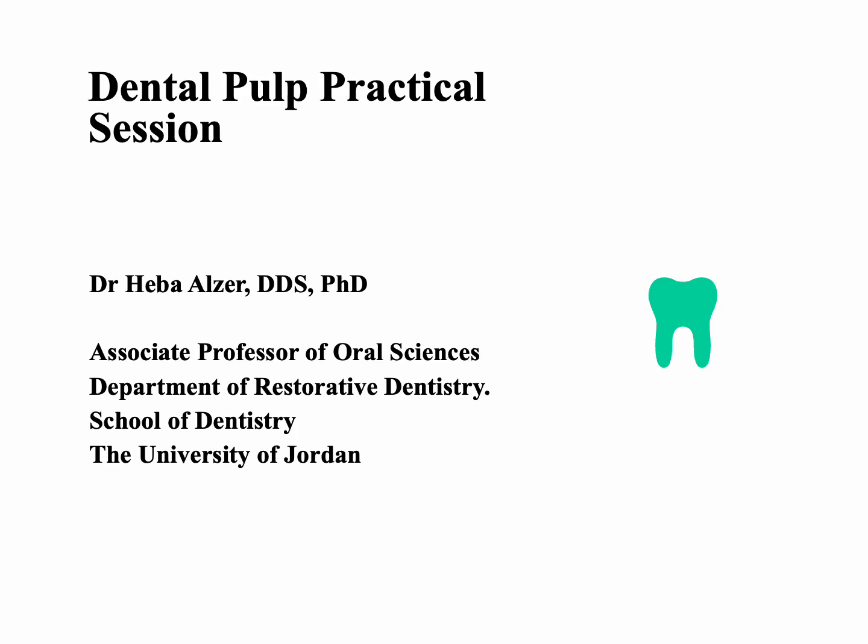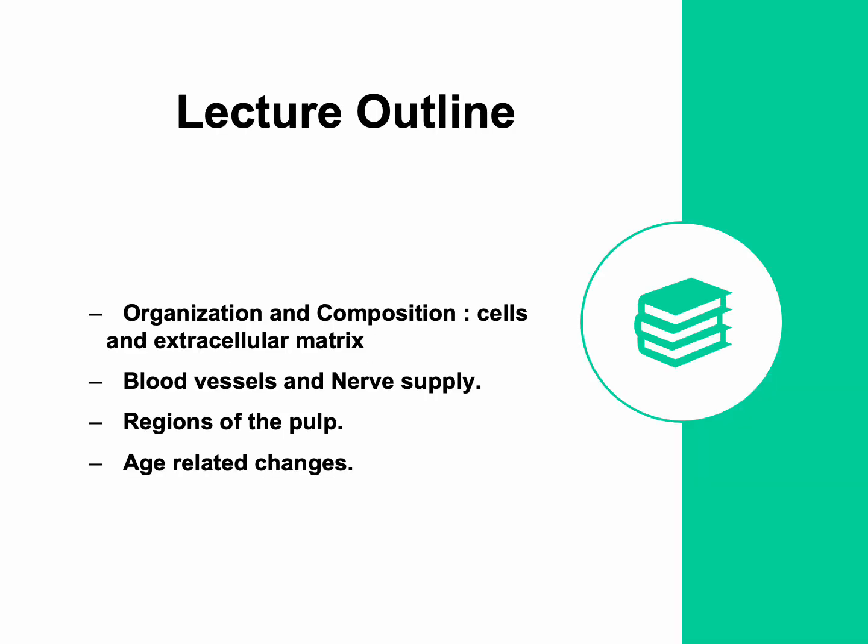Part 3 of Dental Pulp Practical session. In this part, we are going to discuss different regions of the dental pulp when seen under the microscope.